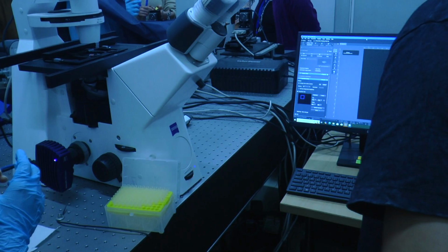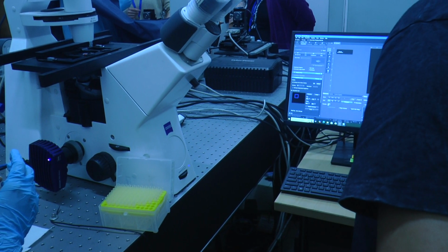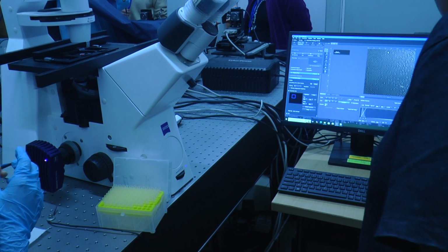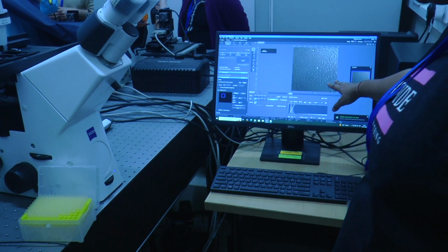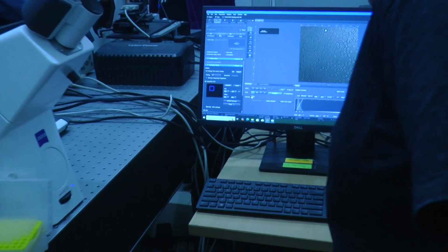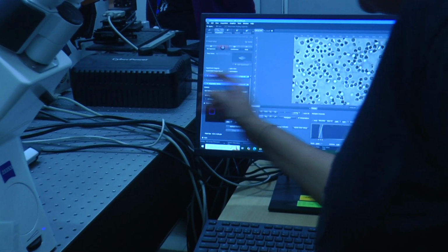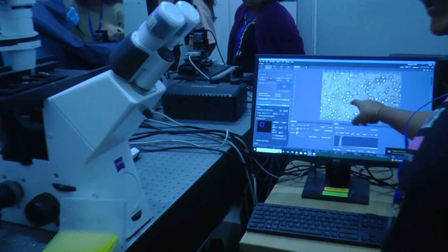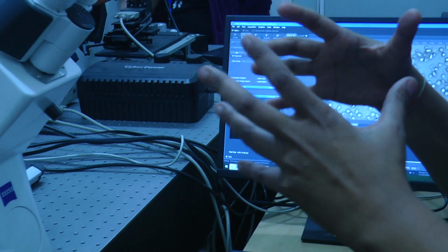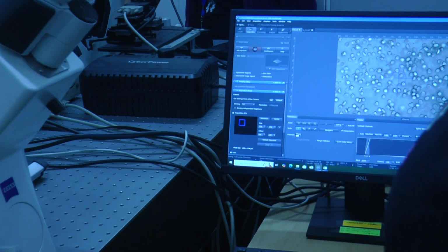Just try to get the feeling to this point. So this is how it's supposed to look for 0.9% saline solution. And what you are getting is this. You cannot see the center, right? Because they're bloated, because of which you will not be able to. You have to go up to the second one.